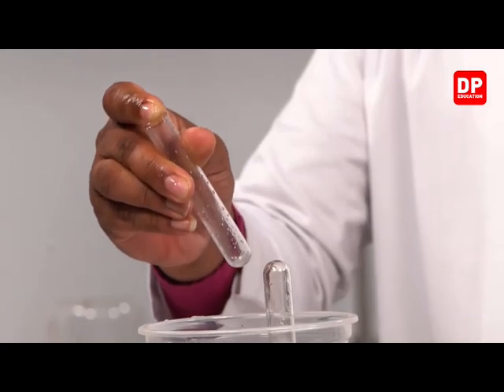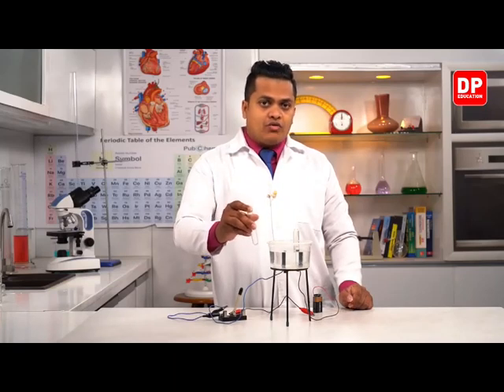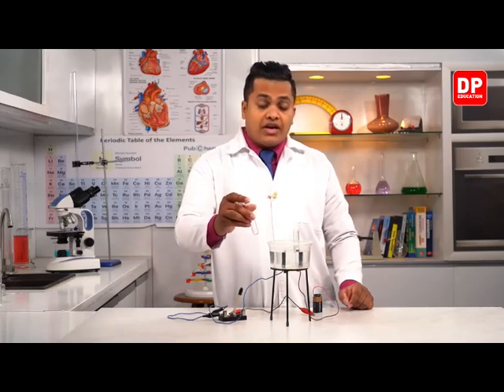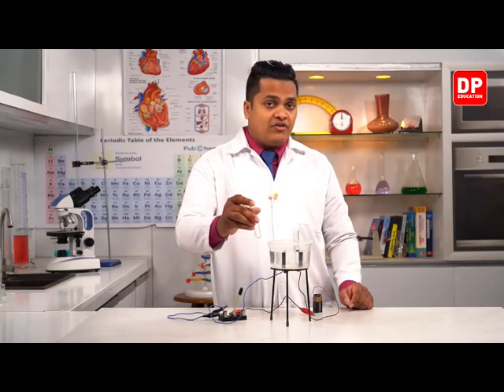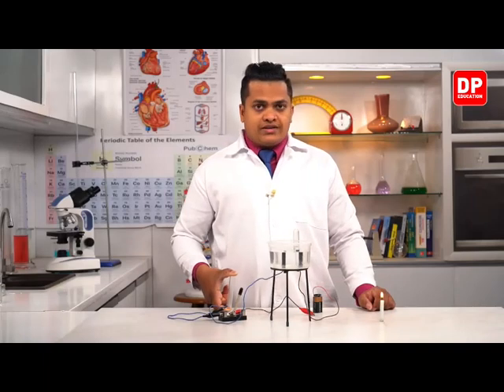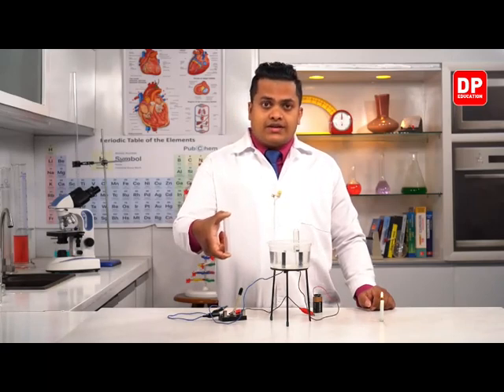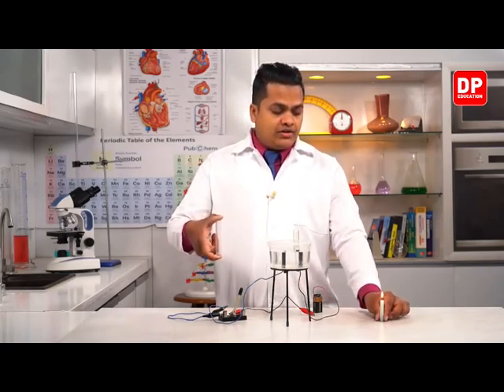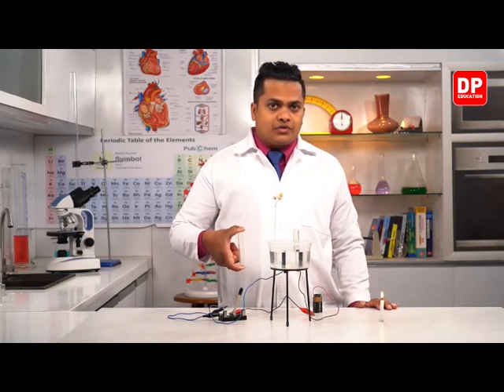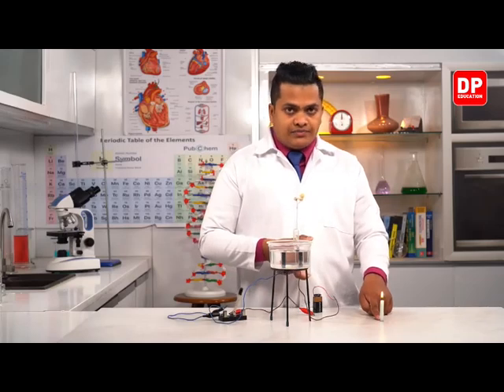So let's insert a glowing splinter into this gas and we'll observe what is our observation from the splinter experiment. So my dear children, now we are going to insert a splinter, but however, rather than inserting a splinter into this gaseous container, I'm going to insert this gas container into a lighted candle. So we'll observe what's going to happen.